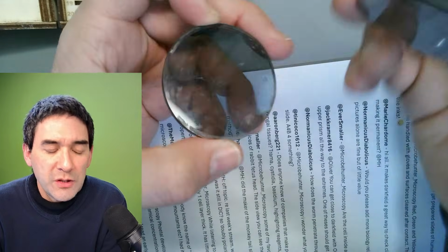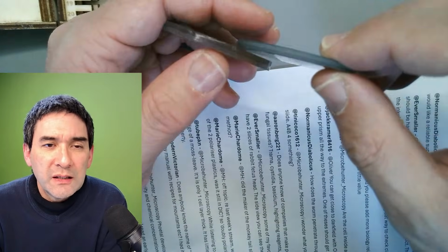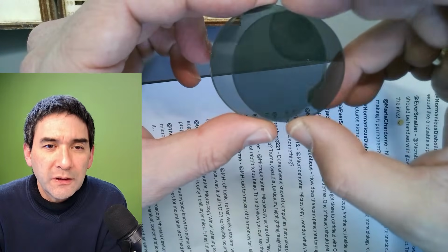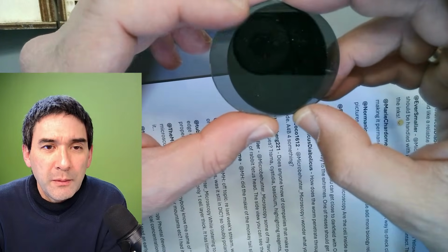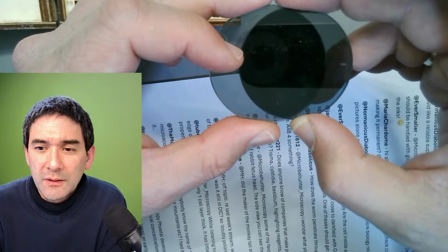And that's essentially something that can be done quite cheaply. I would probably not buy those glass ones. I got them from very old camera filters. But there are extremely cheap polarizing plastic filters.